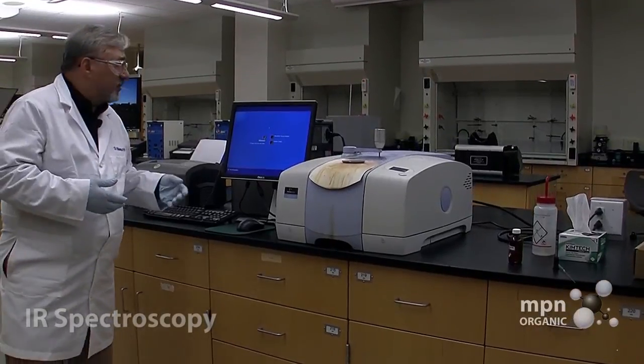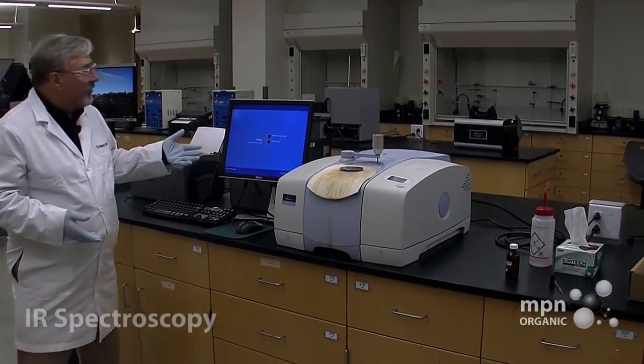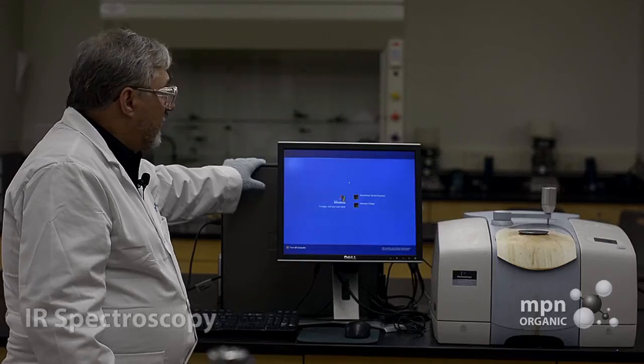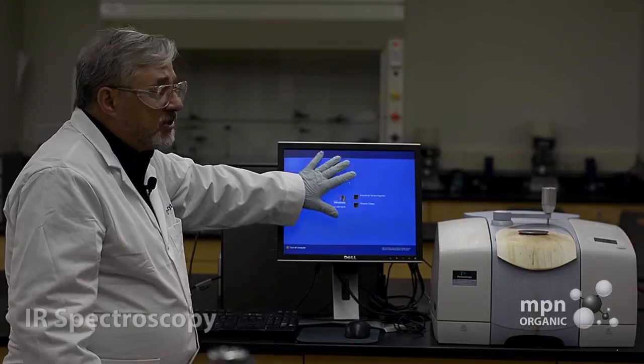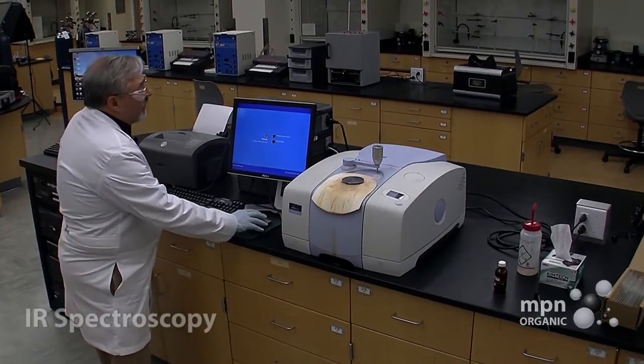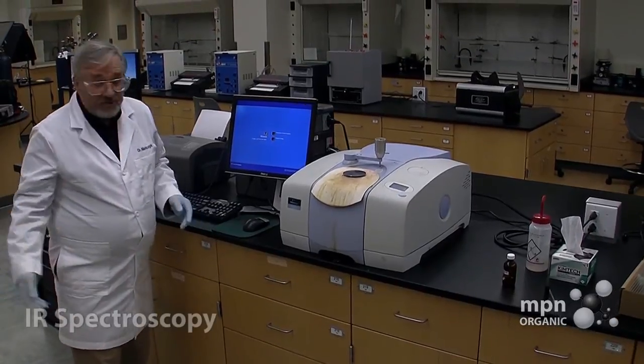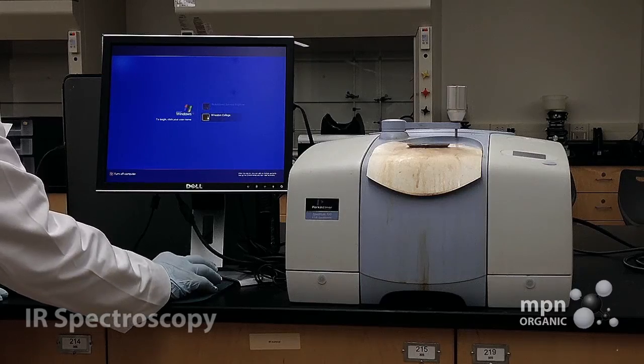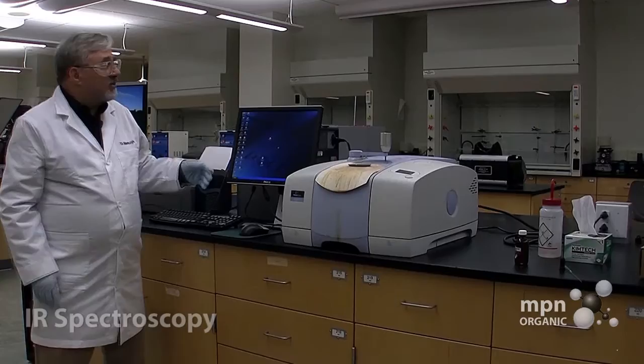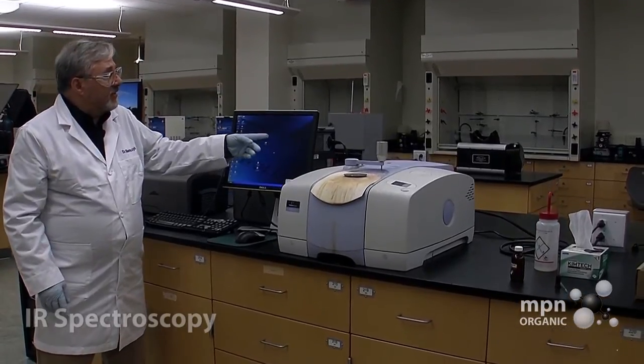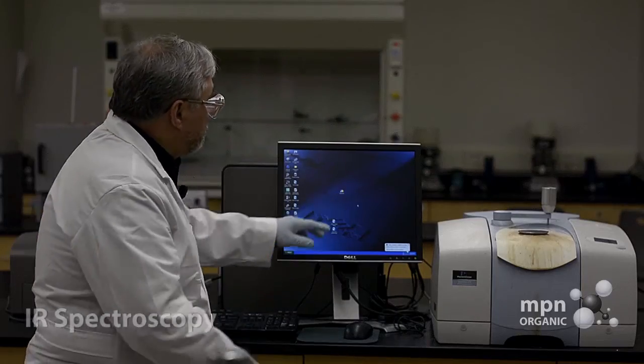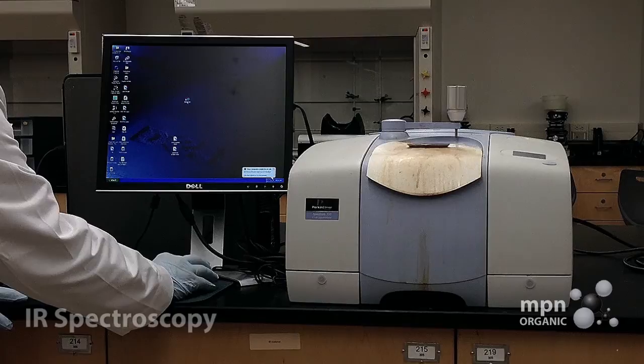So the first thing we have to do is to turn on the instrument. And we do that by means of turning on the computer that's behind this screen here. We're going to come to this screen first, and since this is at Wheaton College, we're going to click on Wheaton College. And we're going to then come to this screen. Now this screen has an icon pretty much in the middle of the screen called Spectrum, and we're going to click on that.